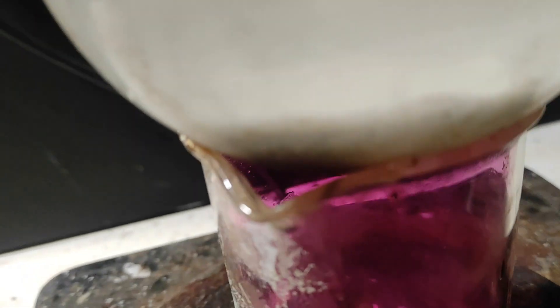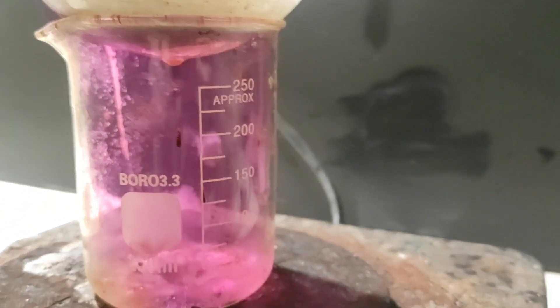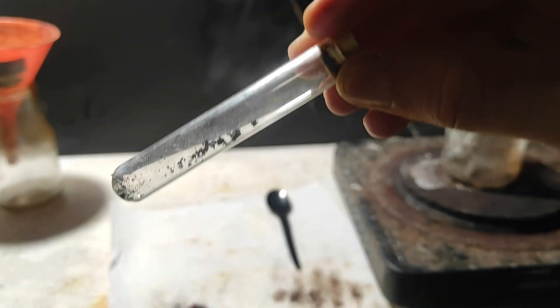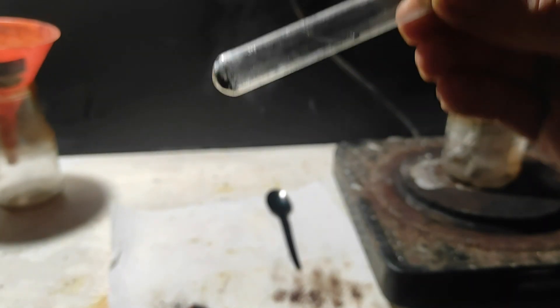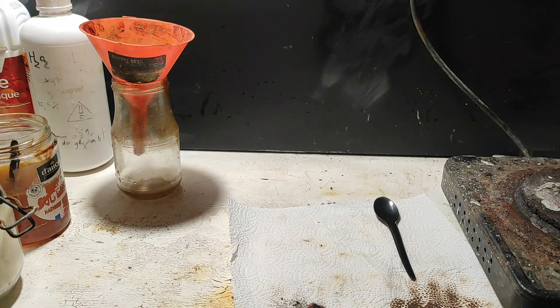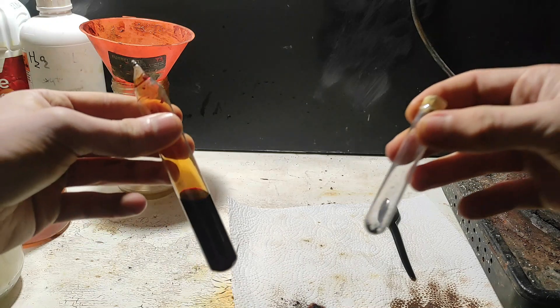I lost the footage of scraping the iodine, but it's nothing difficult — I just did it with my plastic spoon as always, but the yield I got is pretty bad. I put all the iodine in this sealed mini test tube. As you can see, the crystals are very dark and small, but it's okay since I will only have them as a collection.